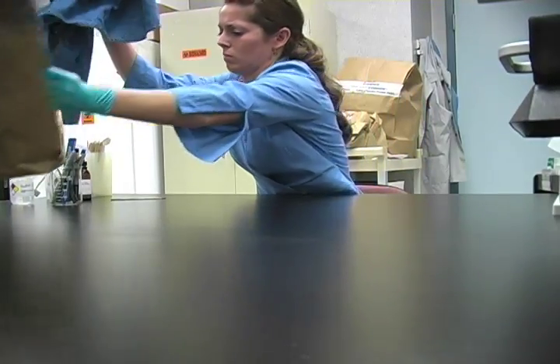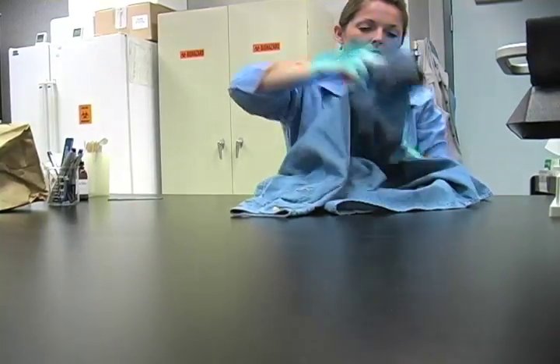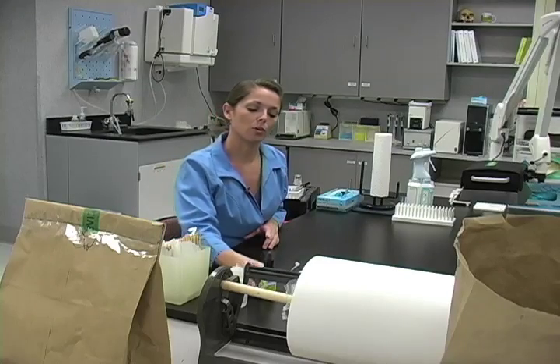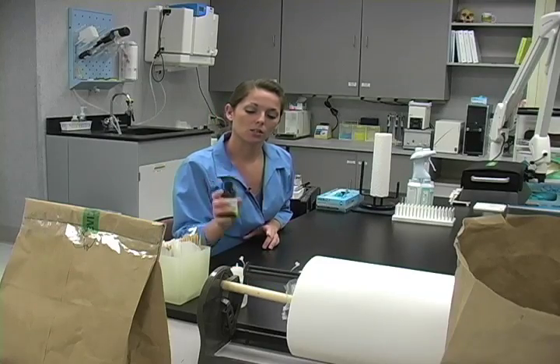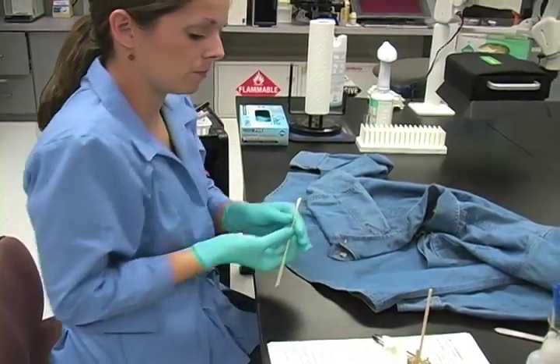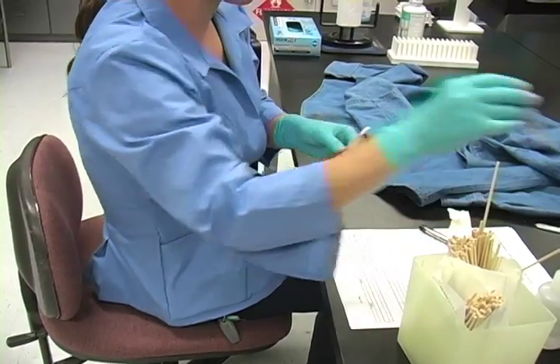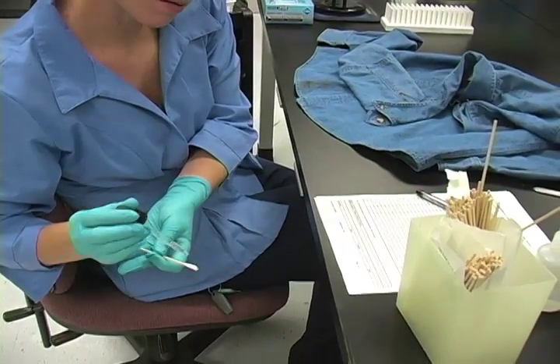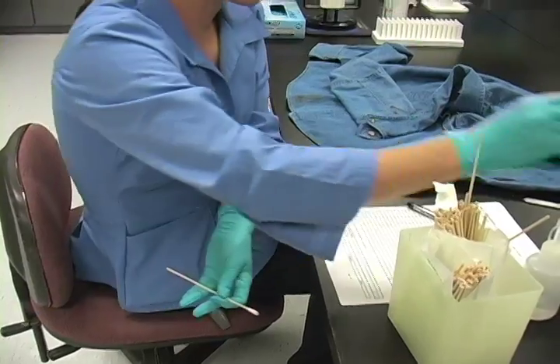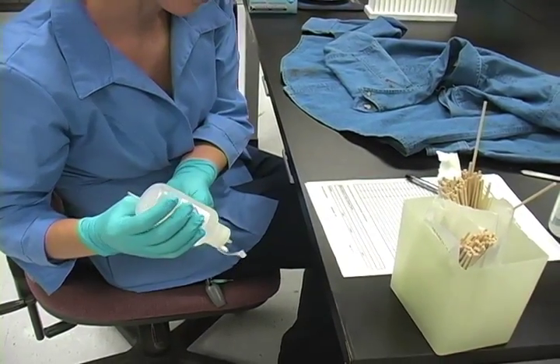does is I'm going to take a swabbing of a type of sample that I suspect to be blood, and then I will put a drop of the phenolphthalein solution onto the swab. The phenolphthalein reacts with the heme group, the iron in the blood, and once I add the hydrogen peroxide, the positive will show pink, and then the negative will show no color change.